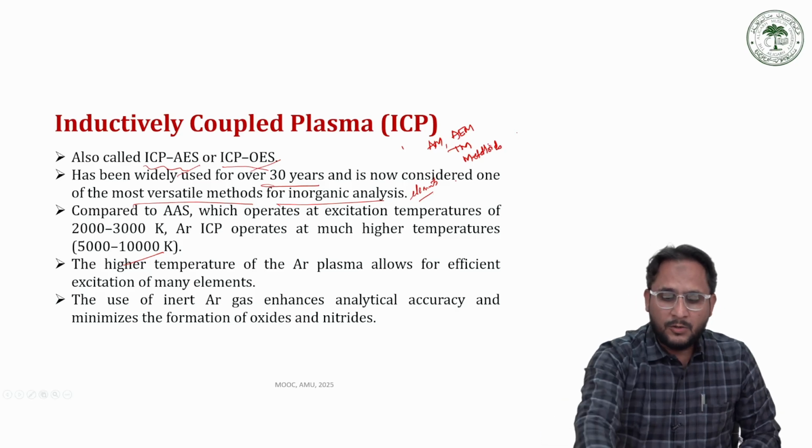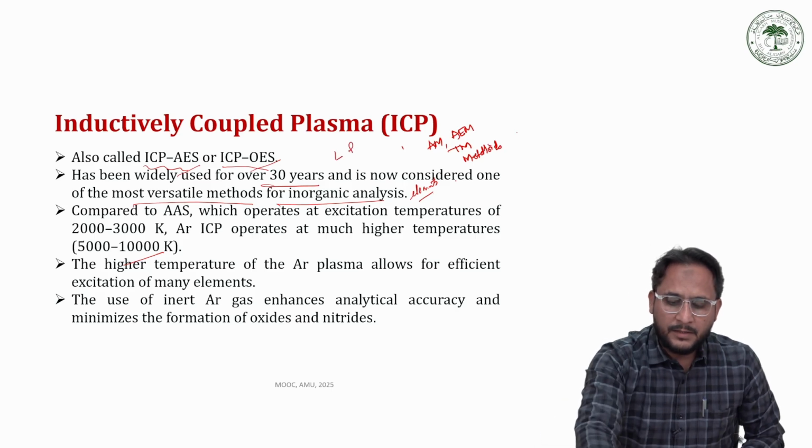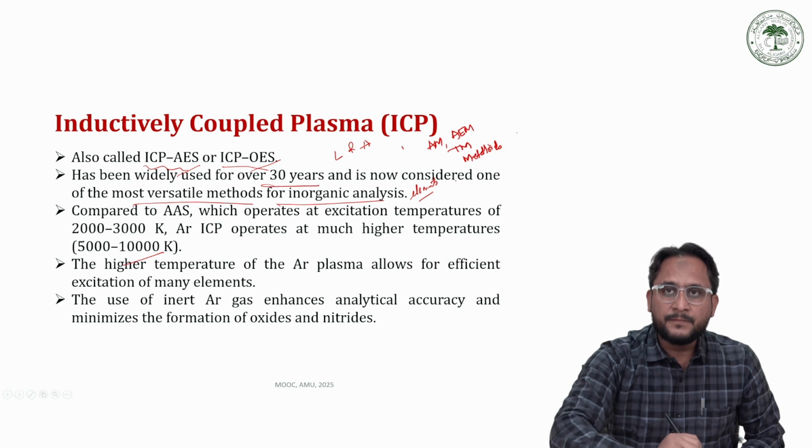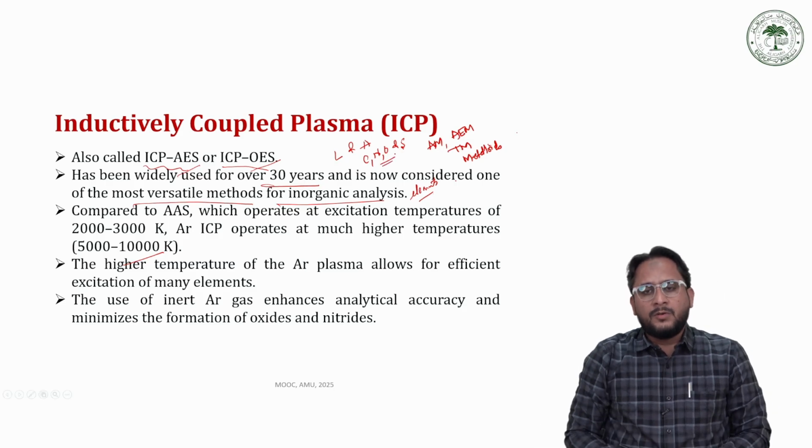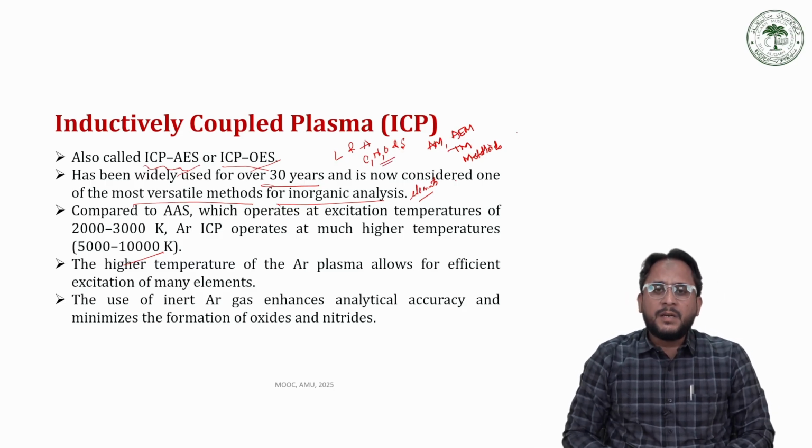We can also go for lanthanides as well as a few actinides. Further, some non-metals like carbon, nitrogen, oxygen and sulfur are also studied by the ICP technique.